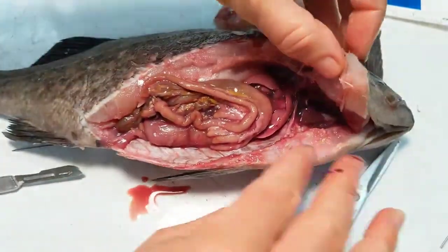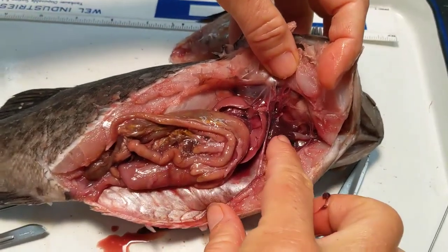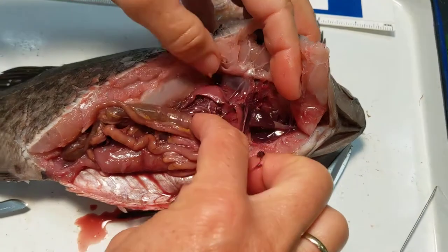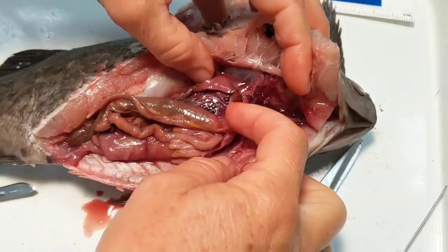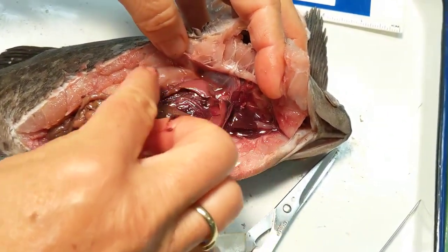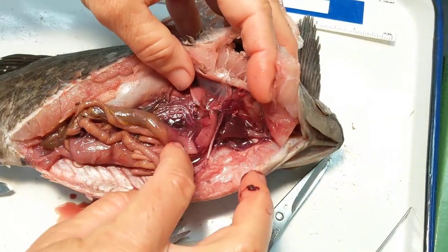Here we are inside of our fish, looking at the organ anatomy. We see the heart up there in the throat region. We can see the bilobed liver, which is quite small in a bony fish. In the sharks, it will fill almost this entire body cavity.